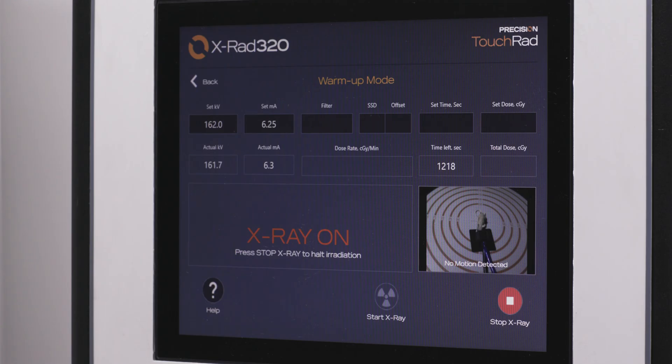To keep your system running at its optimal performance, upon login, the system prompts users to perform a system warm-up, extending the life of your tube.